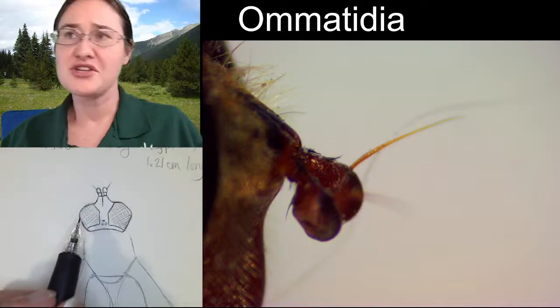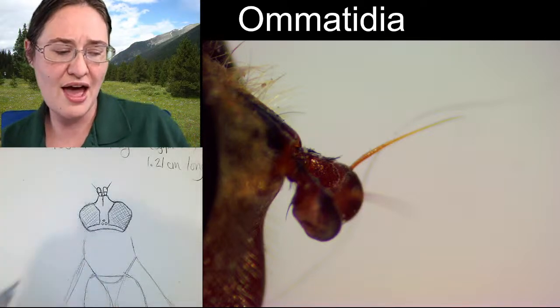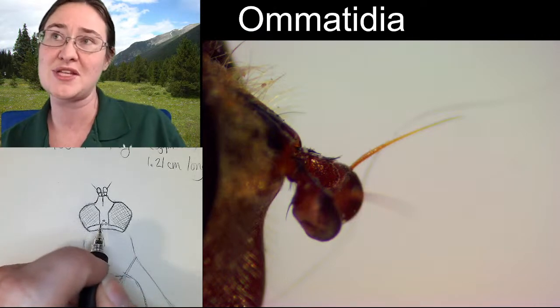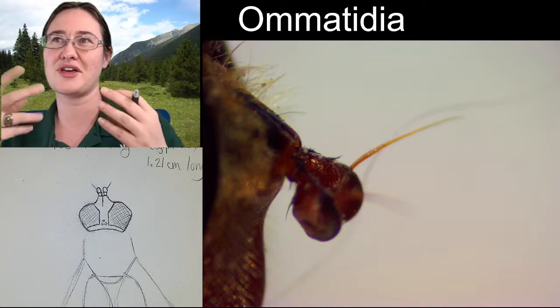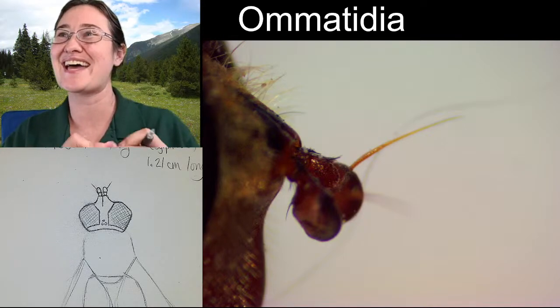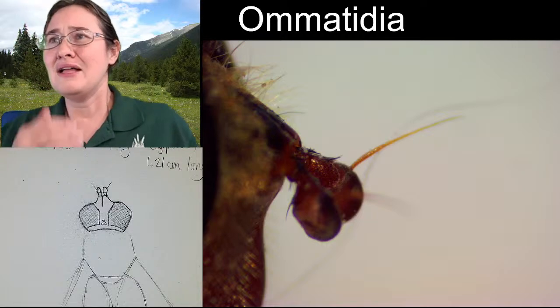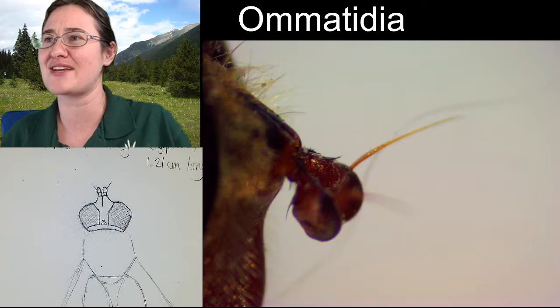All right, so we've got compound eyes, we have these little aristate antennae, we have these little ocelli, singular, if you were talking about one of them, it's the ocellus. I always love the common, or the simple versus complex when it's different than just adding an S, you know? All right, so we're going to flip over and we're going to check out this thoracic region.